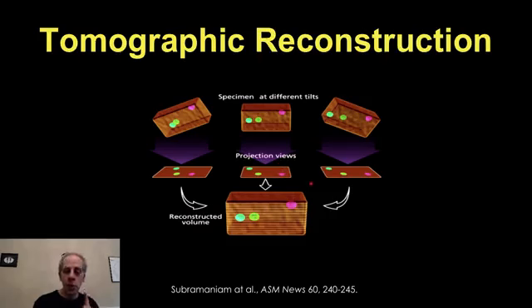Now, there is one thing that I want to explain here. When you're doing the projection, you can see this is very thin. So I'm illustrating it much wider. We're talking about very, very thin. So when you do cryotomography or cryomicroscopy, you have a very thin slice at cryo temperatures. So if I do the projection and try to throw electrons from here, you're not going to get a lot because it's very, very thin.